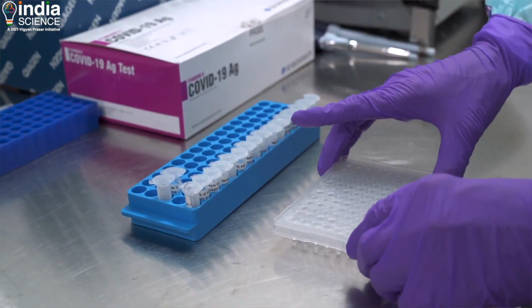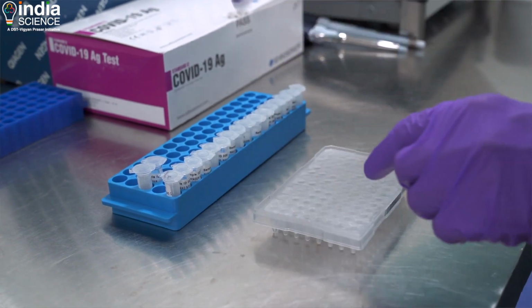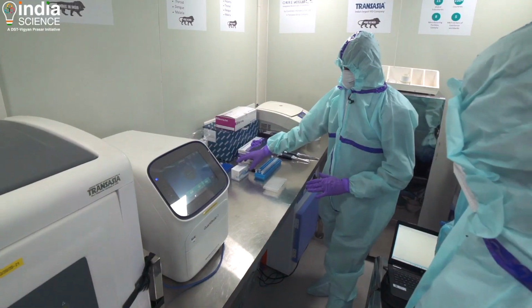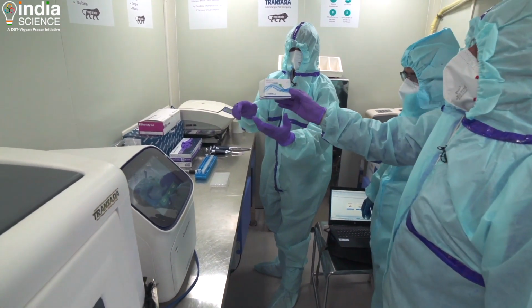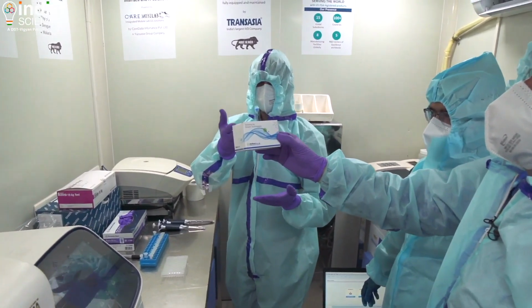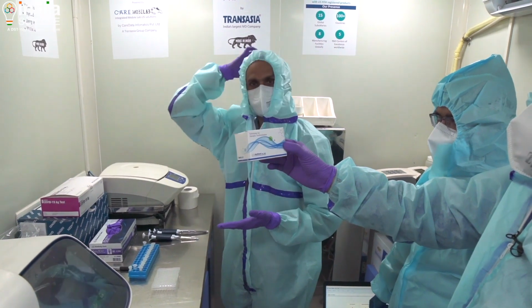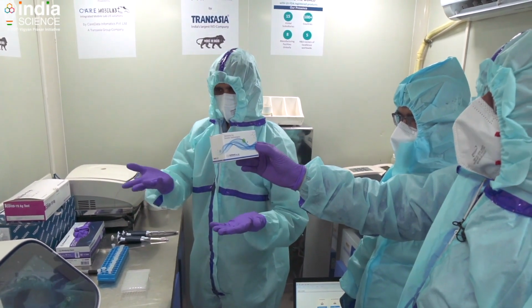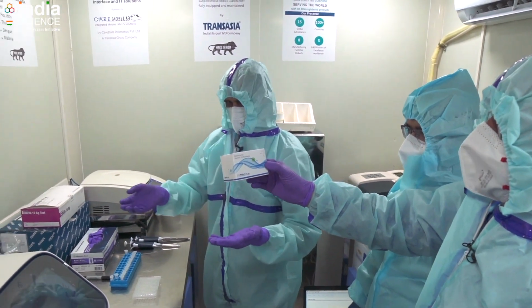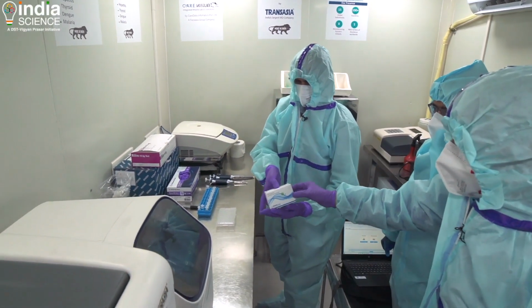When the RNA is ready, we set up our RT-PCR in these 96-well plates. This is the RT-PCR kit that we are using currently. There are multiple manufacturers, as you know, mostly from India now. So we use one of the RT-PCR kits that is supplied by the government, and we set up our RT-PCR reaction. Then what happens inside?